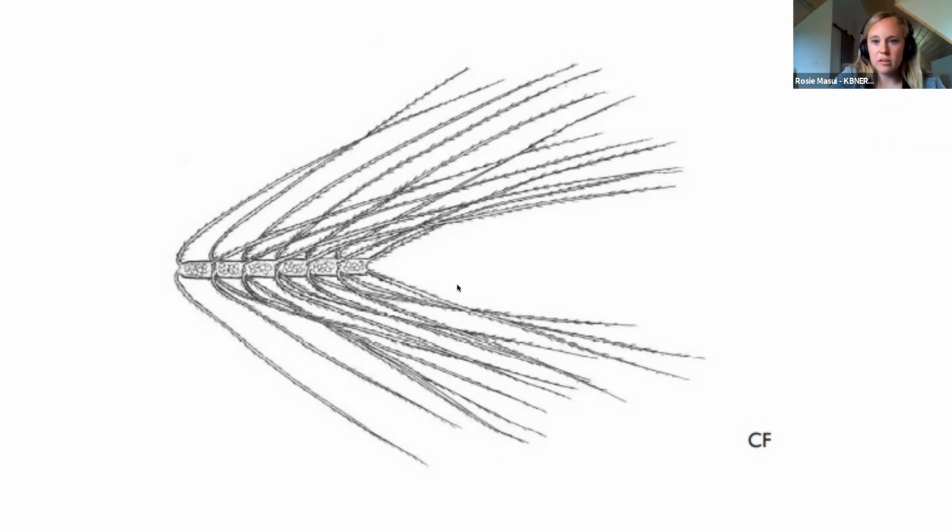So they can look a little bit different, but one thing to do also is make sure to take photos. When we get into the sampling section of this, we can talk about some tips, if you are sampling phytoplankton, on how to collect photos, even just using your iPhone and the microscope.